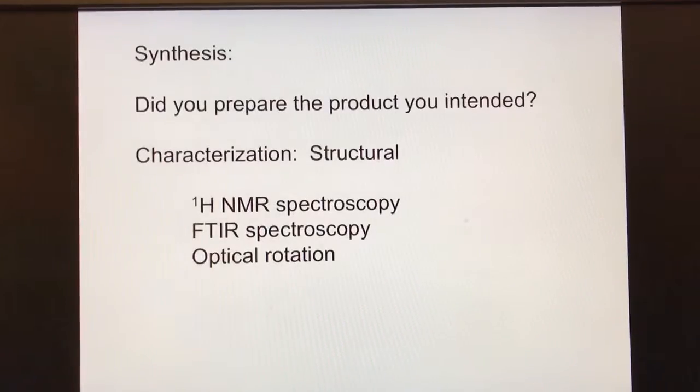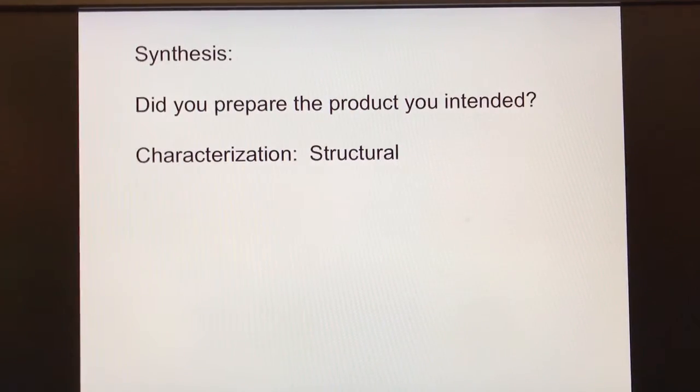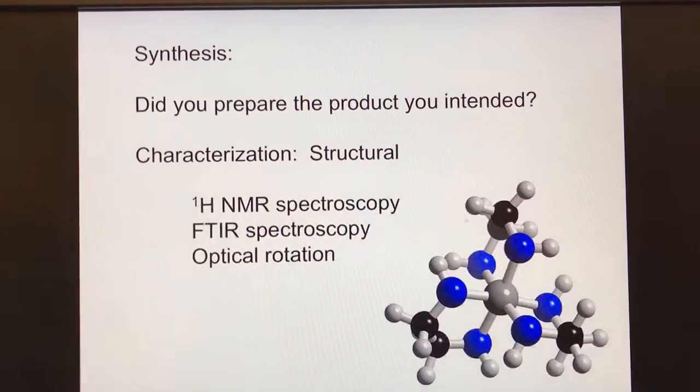So you'll be carrying out the characterization steps. All right, did you prepare the one you intended? And the first steps will be to do structural characterization. So you will be carrying out proton NMR spectroscopy, as well as FTIR and optical rotation. I wanted to show this structure.